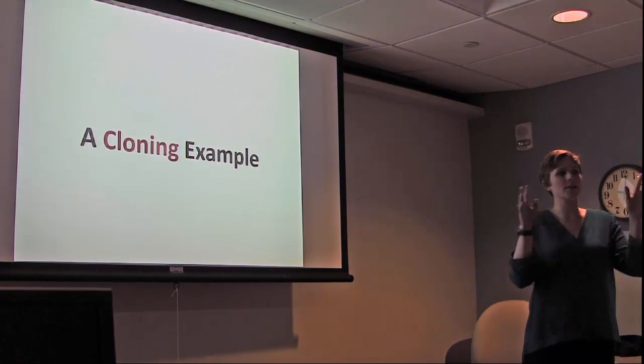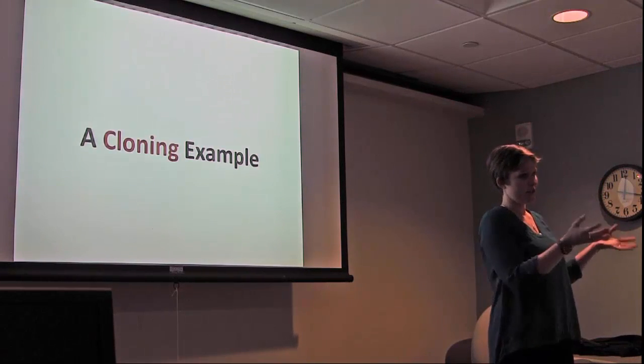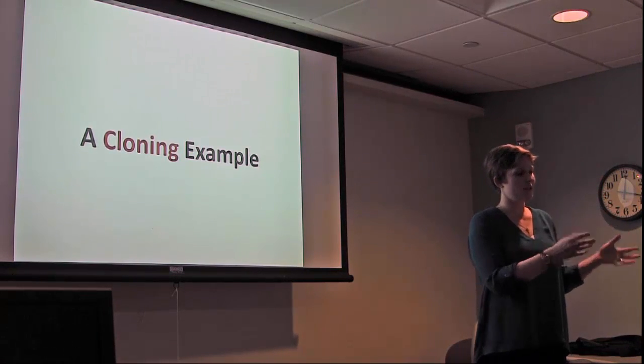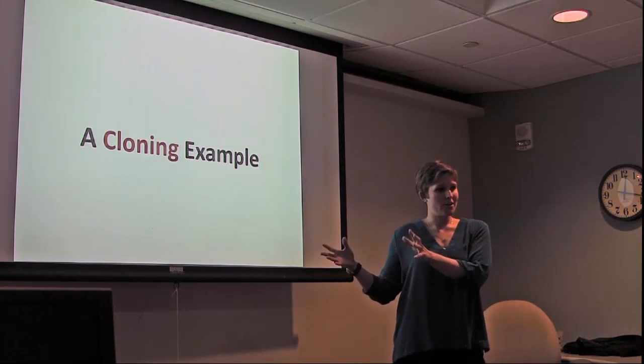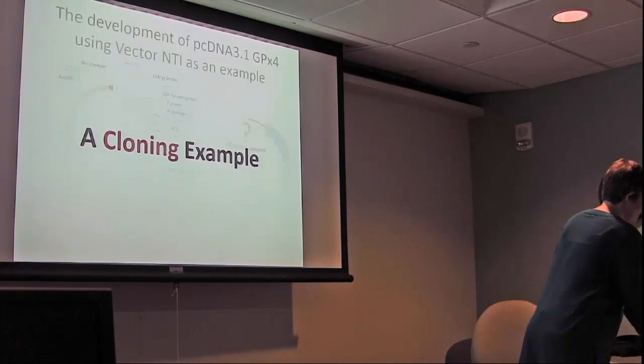Okay, so this is our example. I am going to take you from having a vector that I want to put my gene of interest into and a gene of interest, and show you how I can plan the cloning process.